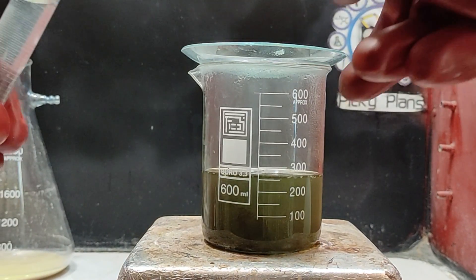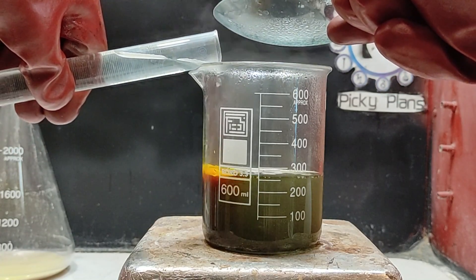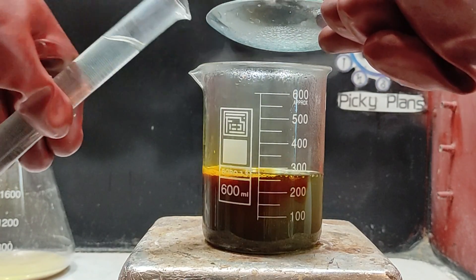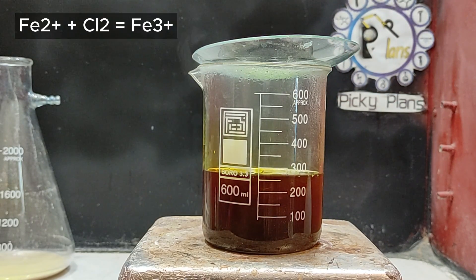I attempted to dissolve the gold by adding some bleach, but it appears to be impossible due to the high concentration of ferrous ion in the solution acting as a reducing agent. That's why the solution turned brown after the addition of bleach — the ferrous ion turned into the ferric ion.